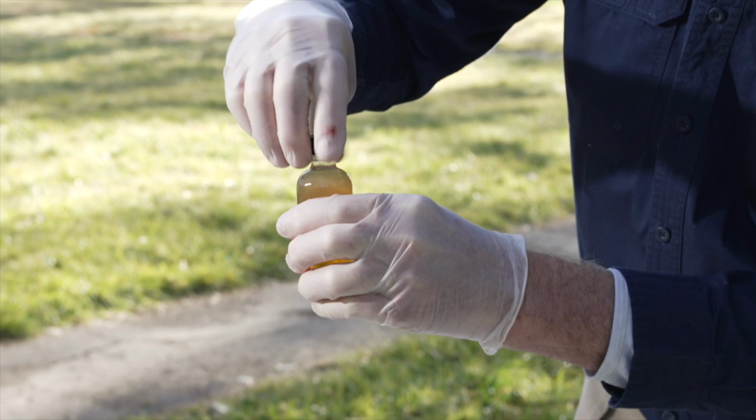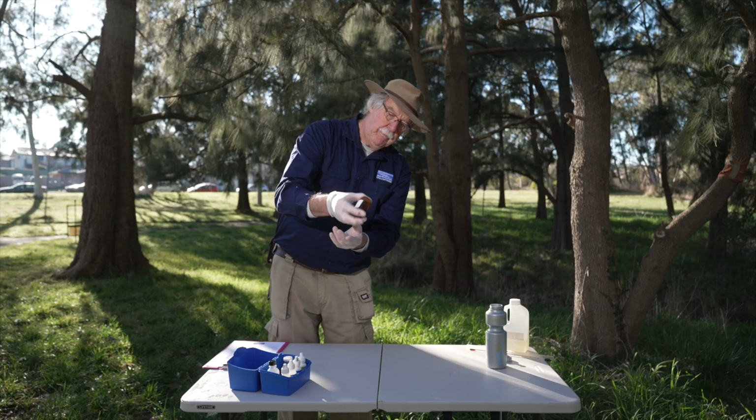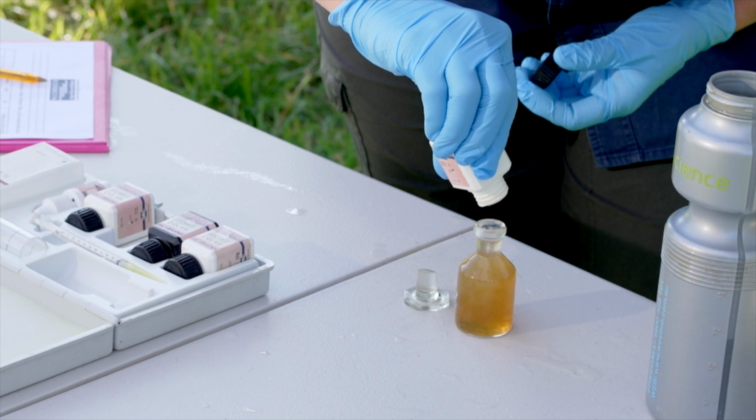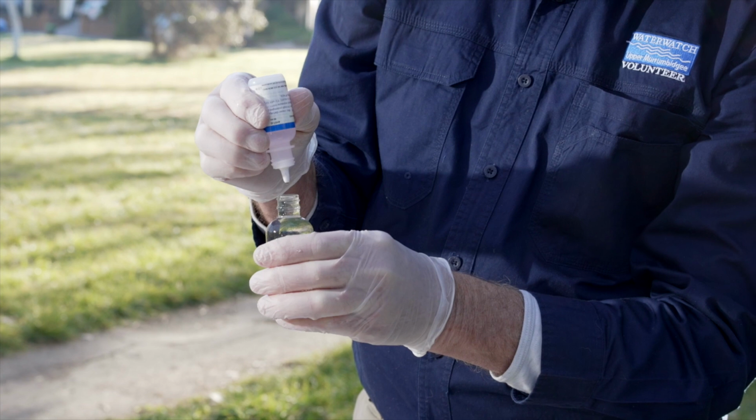Good technique in the use of our equipment is vital to obtain accurate measurements of water quality. Consider the following techniques to ensure you are collecting good and accurate data. Use provided caps, not your fingers, to cover the tubes when shaking mixtures. Dispense liquid reagents from the dropper bottle by holding the bottle vertically, upside down, and gently squeezing 1 drop at a time. Immediately wipe up any spilled reagent.